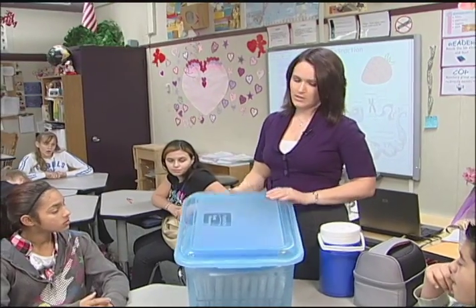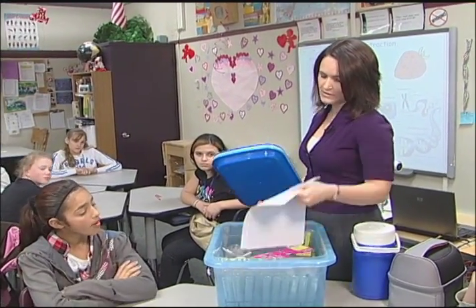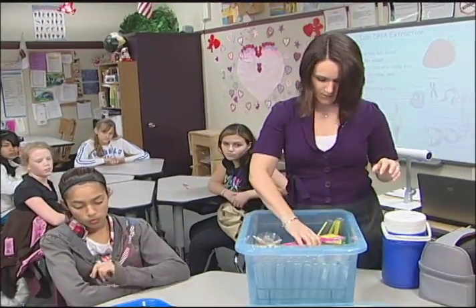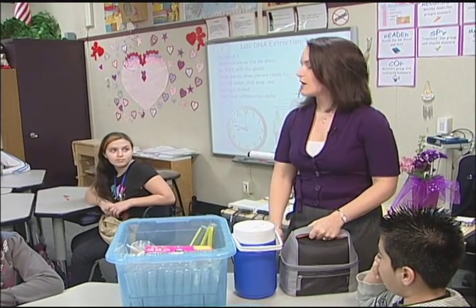Let's go over the materials we're going to need for the lab. You're going to need the material sheet because it's going to list everything you need. Then you're going to need a tray because there's a lot of materials for this lab. Last time we did DNA extraction with wheat germ; today we're going to use strawberries.